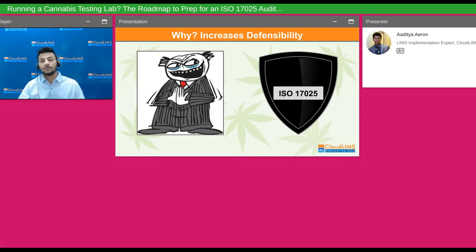And then finally, you've got measurement traceability, which further assures the person filing, or rather investigating the matter, that you've actually got everything in place, and therefore the results that you generated are 100% genuine and correct. So you can actually defend yourself from such uninvited trouble.